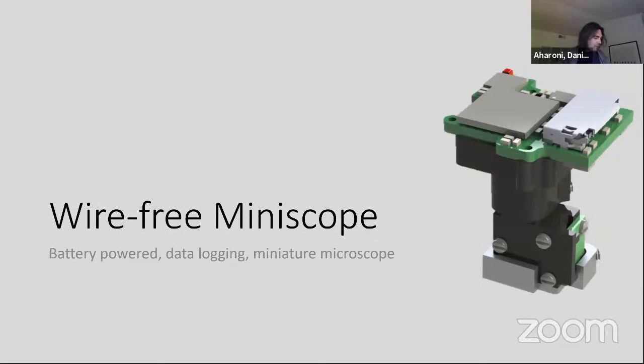As I mentioned, we've done a lot of work on minimizing the cabling because that's really important to get natural behavior out of the animal. But for some cases, you might want to completely remove any tethering that comes from the animal to off-board electronics. So we've developed what we call wire-free miniscopes. They have a battery that's oftentimes mounted to the side of the miniscope, and they log data to an onboard SD card. All of the electronics have been redesigned to make them as power efficient as possible.